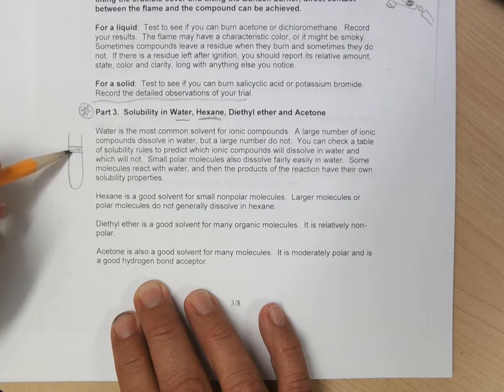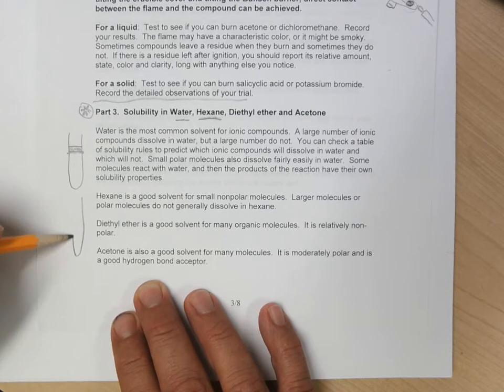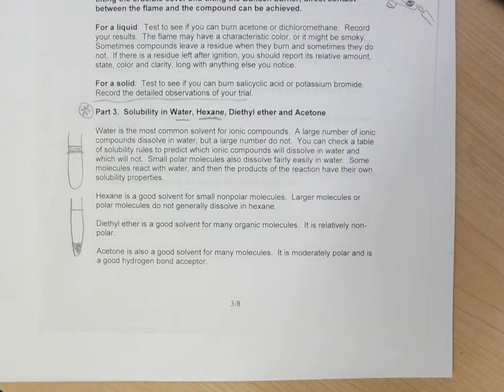If it floats on the top, and you can see the clear barrier between the two liquids, there's some separation there, then it's not soluble and less dense, right? You mix it up really well, and if rather than dissolving, it just floats to the top, it's not soluble and less dense. If you put a liquid in, sometimes it's more dense than your solvent and it sinks to the bottom. You can stir it up like crazy and shake it and put it in a vibrational mixer. Sometimes it just separates out again.